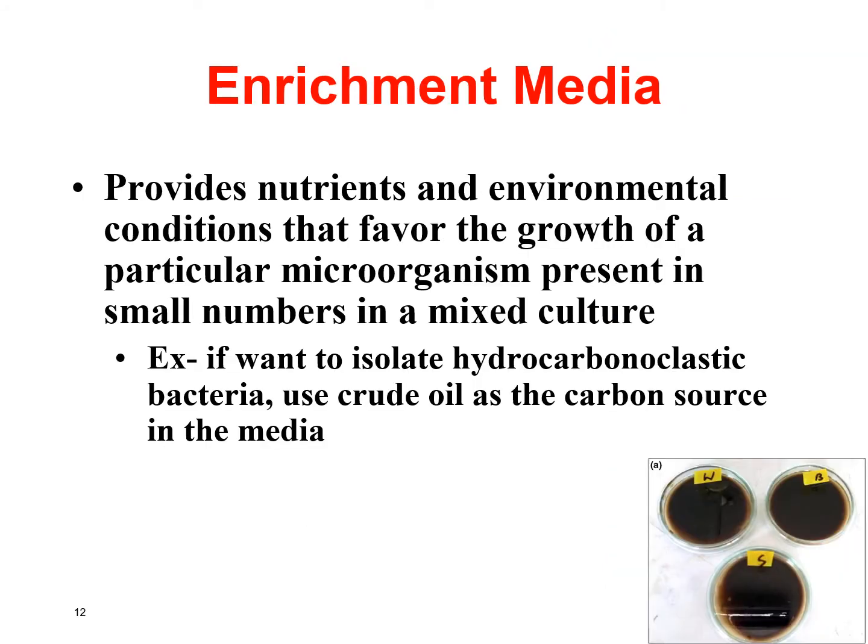Okay, and the last type of functional culture media is called enrichment media. So this is where you've got a particular microorganism that you want to favor the growth of. So you're going to add its favorite food to the culture media. And that'll allow it to grow in larger numbers. So then you can have a bigger sample of it to isolate.